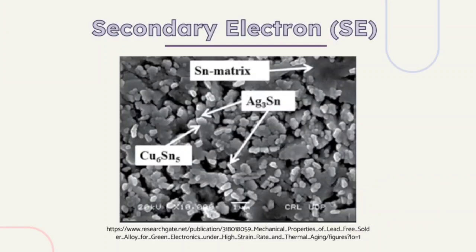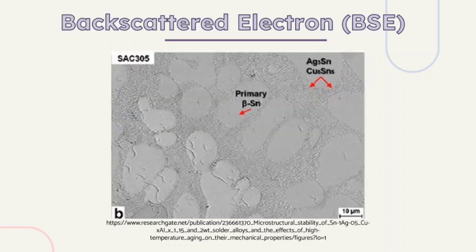From SE and BSE, different results can be obtained. The SE micrograph reveals the topography of the sample surface, where the size and shape of different phases could be observed significantly. The BSE micrograph consists of obvious contrast that separates different phases clearly. The light, smooth gray region is the primary beta-tin matrix, while the darker, rough gray region is the intermetallic compound of Ag3Sn and Cu6Sn5.